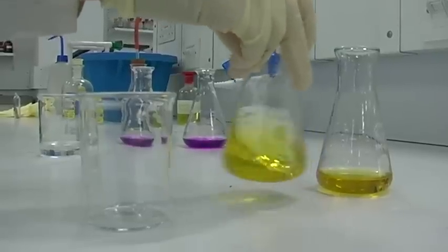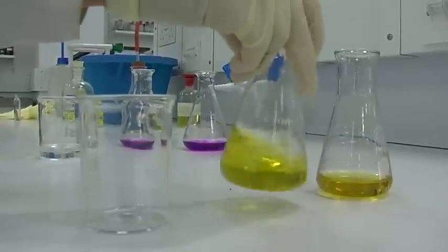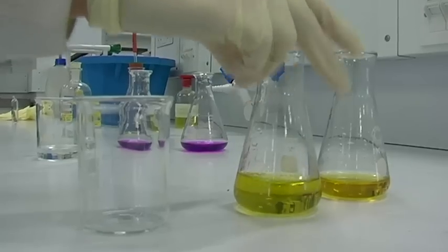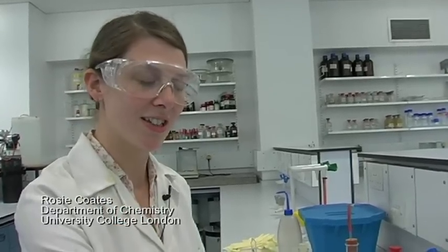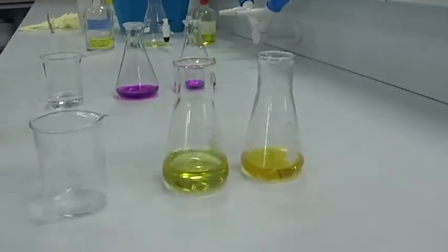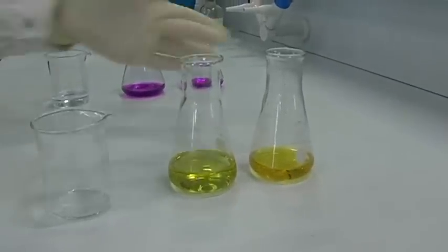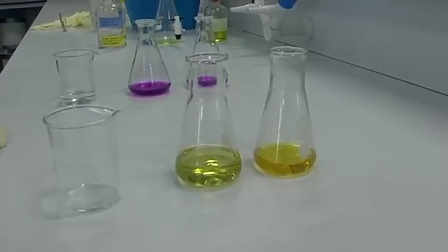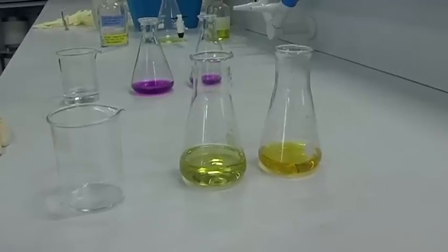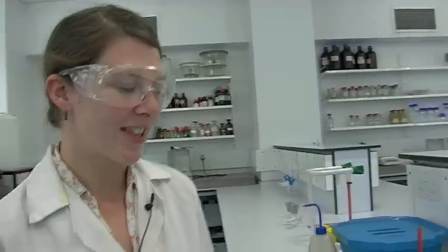This reaction shows an oxidation state change. I've put some alcohol into potassium dichromate solution. The chromium in the potassium dichromate is in the 6 plus oxidation state, and we should see it changing to the 3 plus oxidation state. A 6 plus oxidation state is this really orange color, and a 3 plus is a more green color. Over time that goes even more green and almost bluey. We'll move on to another one.